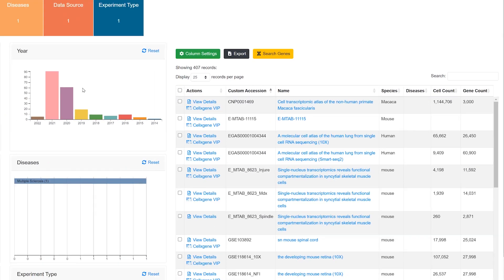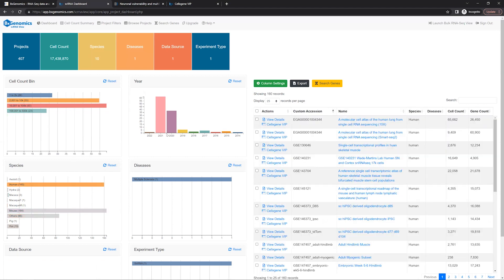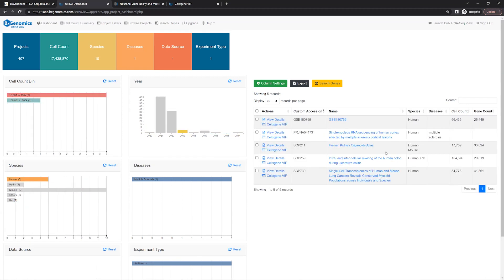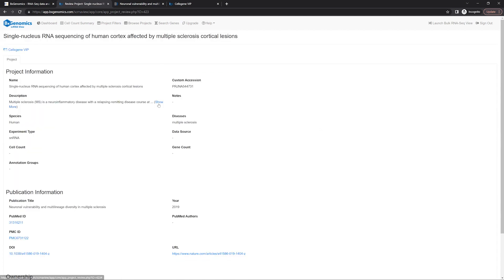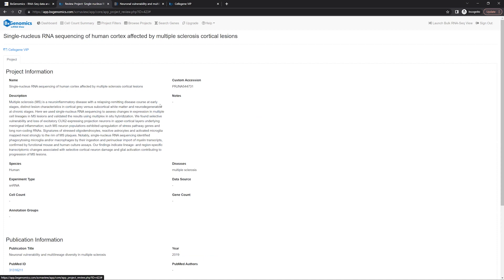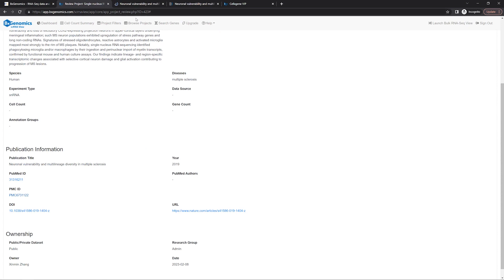From the left side dashboard, we can quickly filter the datasets. For example, I can check for human data published in 2019. This single-nucleus RNA sequencing data of multiple sclerosis is the demo data I'm going to use today. Click the project name to view more information about the dataset. This was published in Nature in 2019, and we can open the publication link to view the paper.